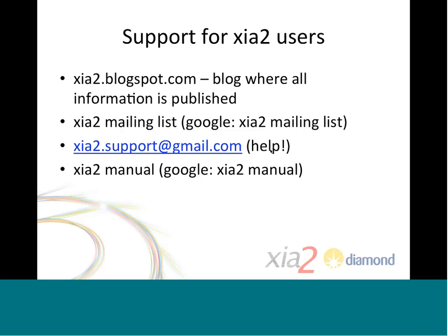Sure. Another question came in: can XIA2 handle anomalous data from atoms other than selenium, or only selenium? No, it will. XIA2, formally speaking, doesn't handle anomalous data at all. All you do is say minus atom whatever, and it separates anomalous pairs. The example I showed you earlier from that fantastic high-resolution data set was actually barium. But really, all you do is say minus atom whatever, and it will separate the anomalous pairs.